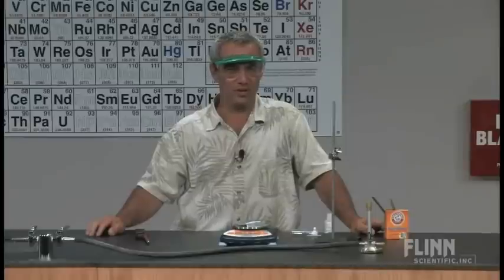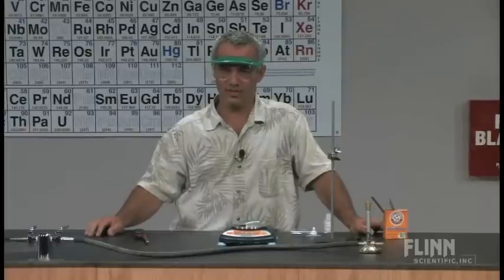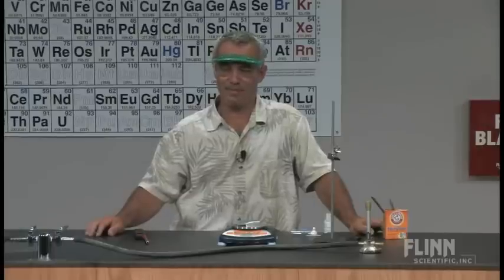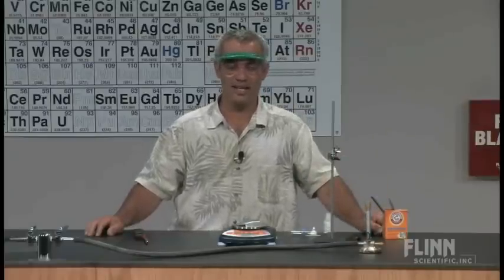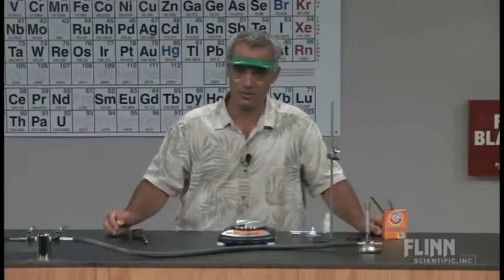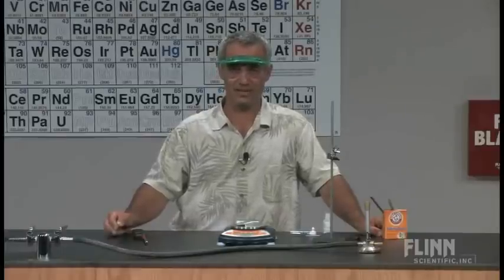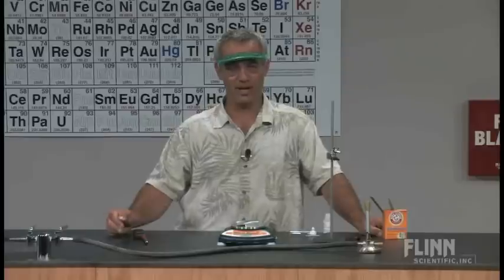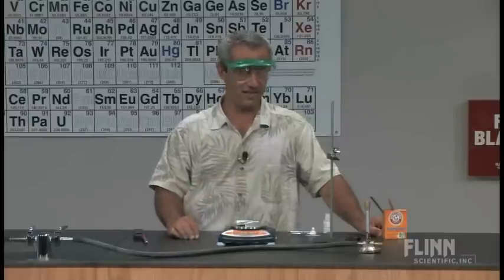Here's one I developed a few years ago that I really like. It's what I call a target lab, one in which the students do some initial measurements very carefully. Their grades depend on it. They then do the lab, carry it out, make observations, figure things out, and at the end they come up to me with a mass that they think their test tube content should weigh. We put it on the scale together and they are graded according to how close it comes. I do a lot of these target-type labs with my students. They really are valuable because it's outcome-based. They're graded by the scale, and that's a very impartial judge.